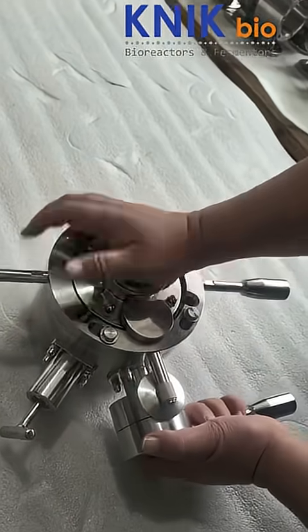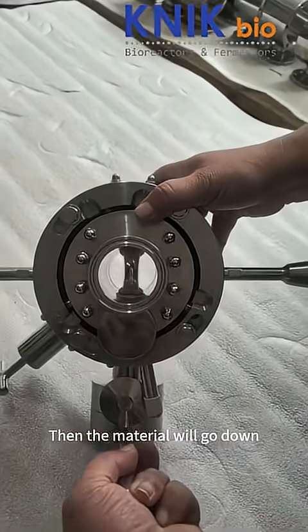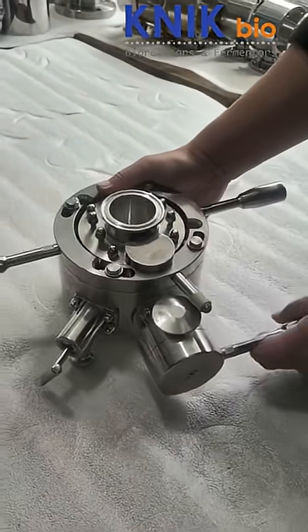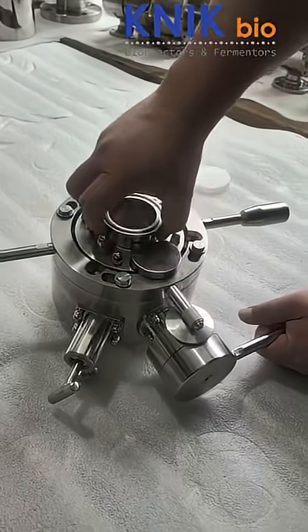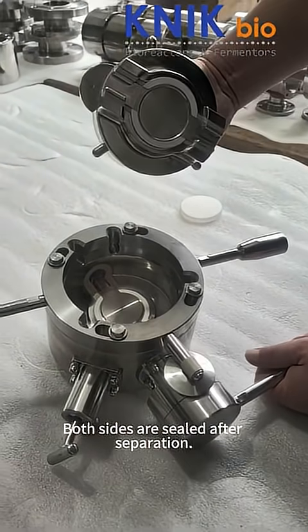Connect like this. Then the material will go down. Separation. Both sides are sealed after separation.